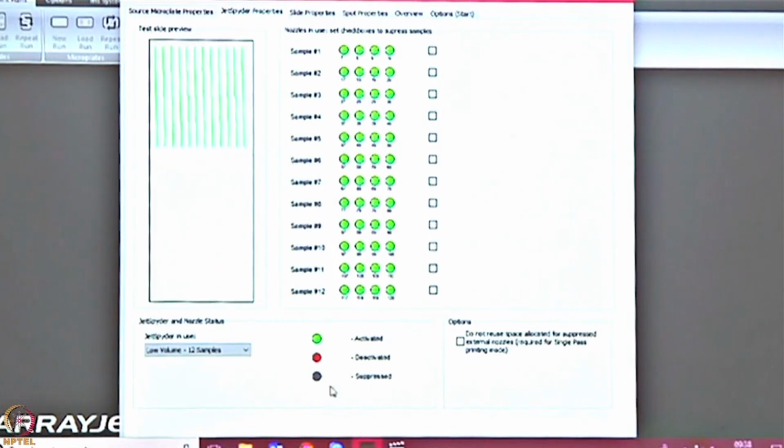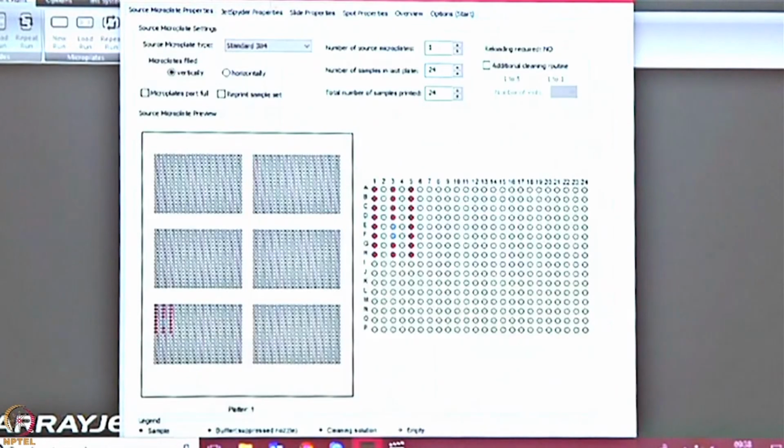So let me try and block them and let me show you what happens. That's your blocked. So now I've got 11. If I move back, I'll have a set of 22 because it's block 2. Do you see that?